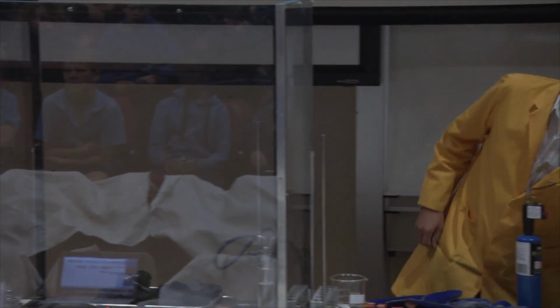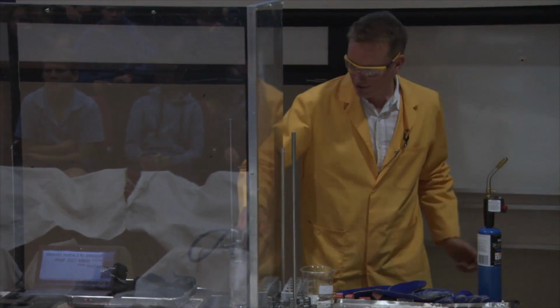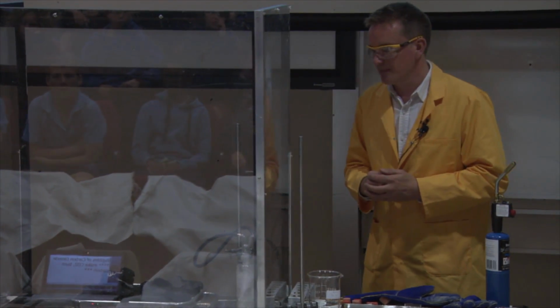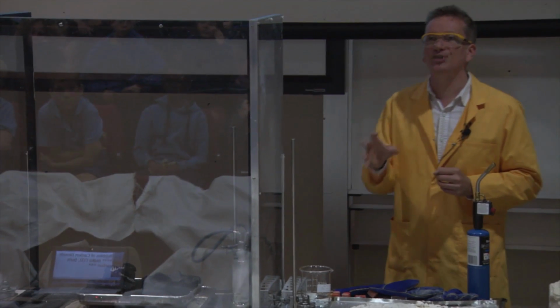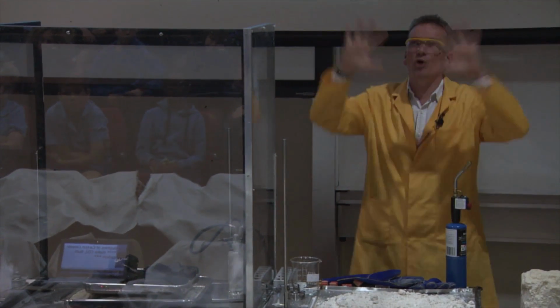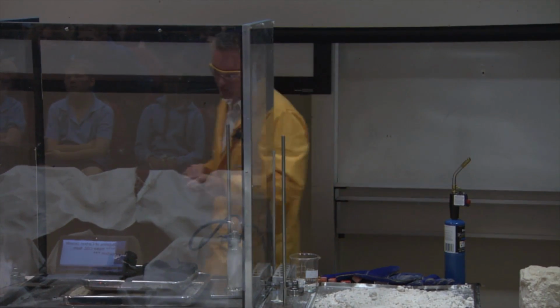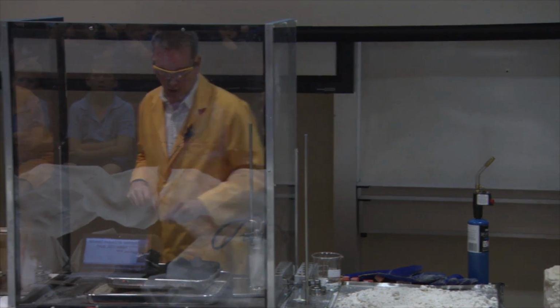It's nice and colourless. I'm going to just switch on a pump that's going to draw some air through this funnel. So it's just bubbling away. Nice colourless solution. But what I'm going to do now is make some carbon dioxide. And I'm going to make it from the elements, from the oxygen around us, and from a little torch here, and from some carbon. So here is our impure form of carbon.